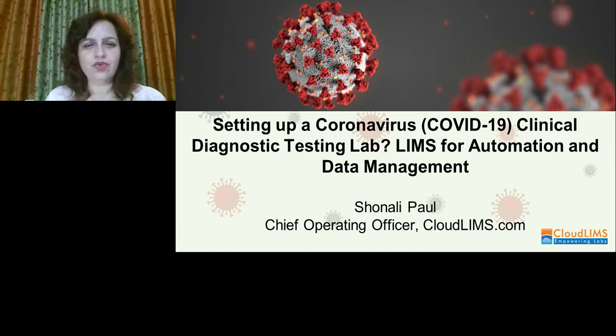As we already know, laboratories around the world are in a race against time, trying to increase the testing of COVID-19 cases and isolate the positives in order to control the spread. The fact that COVID-19 spreads easily makes the case for swift and large amount of testing or mass testing. Detecting the disease allows for quick isolation of such cases and reduces the chances of new infections significantly.